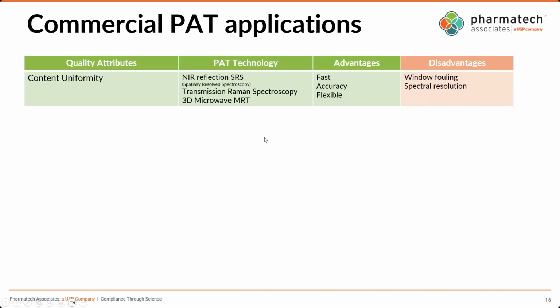Yeah, so I think, Richard, even here, what technology to choose for content uniformity depends on many factors, right? It depends on the material properties or the product properties. It depends on the manufacturing throughput. Are you dealing with a high throughput, high volume manufacturing process? And what are the analytical requirements? So you have to have a good balance between at least these three factors. And again, I wanted to highlight, you have to account for the interoperability as well.